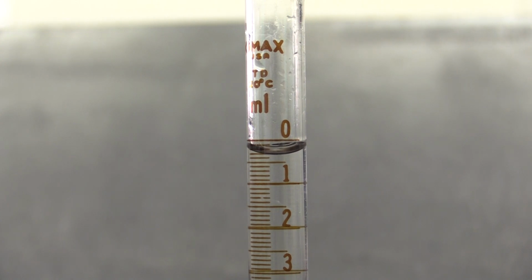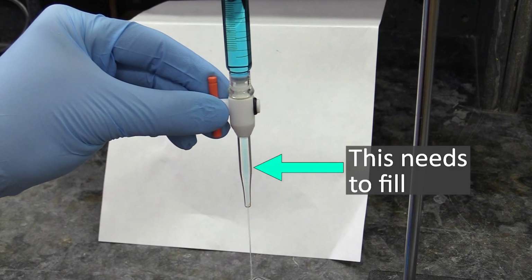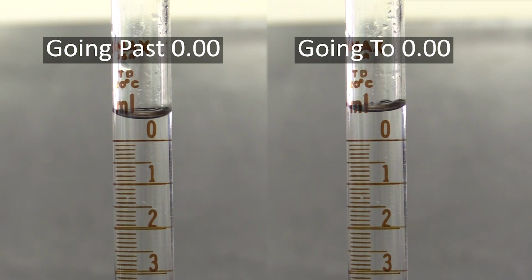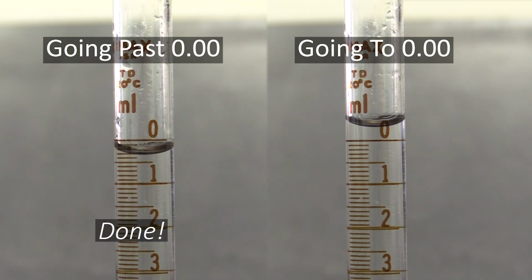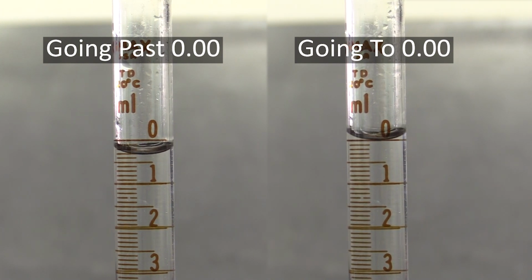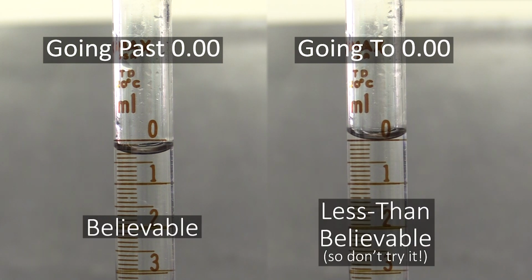There are 2 reasons for doing this. One is it gets all the air out of the spout at the bottom. The other reason is because it is hard, and time-consuming, to get the meniscus down to exactly 0.00, to the point that, for all intents and purposes, it doesn't happen. So, if you are truly reading the meniscus properly, you won't have any 0.00 milliliter readings.